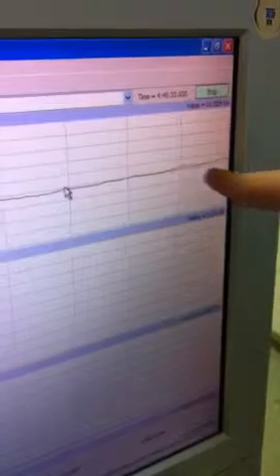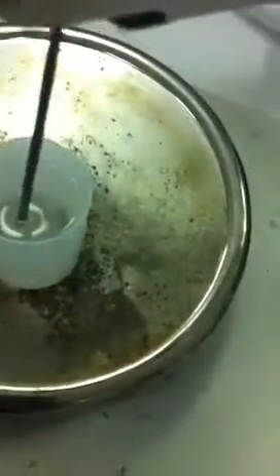So you see the data being plotted from the acquisition of the unit. And there is an electrode in place. Yes, this is the oxygen sensor, connected from the input of the Apollo all the way to our sample here. This is sitting in PBS buffer, and this is our 2 millimeter oxygen electrode, which is the green cable. Which is just the size I want to put in the apparatus that I'm building. So I'm going to stop this now. We can stop, yeah.